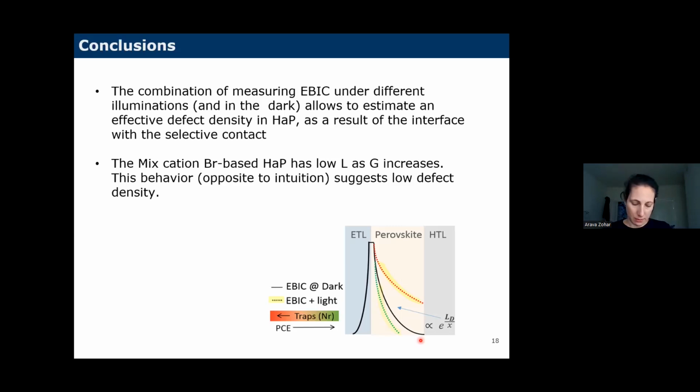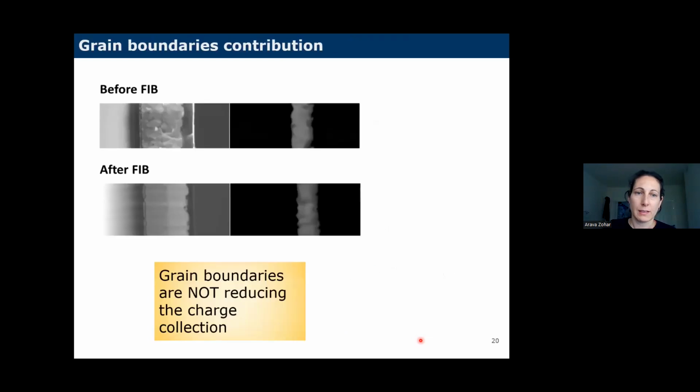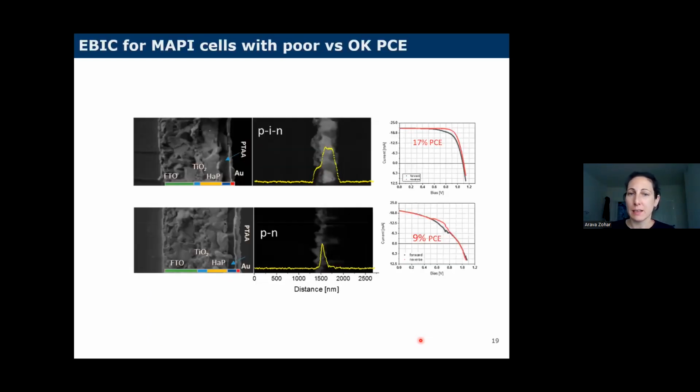Simon asked me also, I don't know if you have like 1 minute, briefly I will mention that we did it for many cells, and it was very easy to see that, among cells from the same batch, sometimes there is just a cell where the quality of the perovskite itself is not as good, and we barely get current through this material. And you can see very nicely the defects. It's not like you did something wrong. It's just that those spots specifically didn't give nice cells.